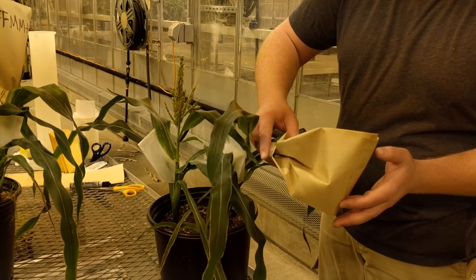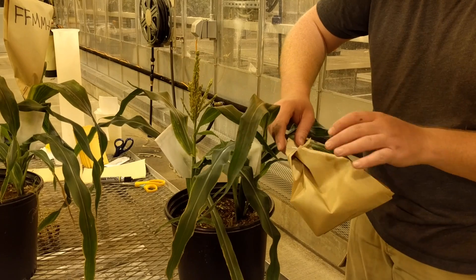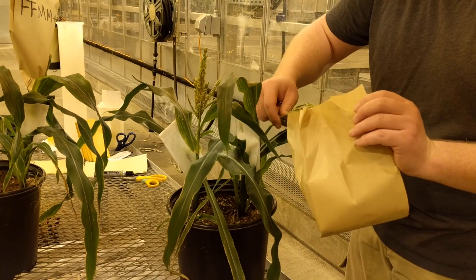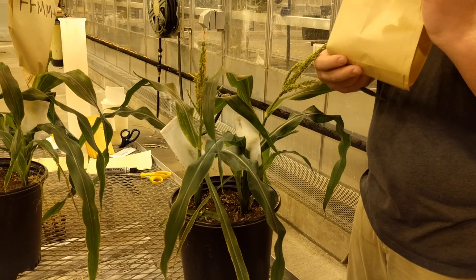Carefully bend the plant over so that any pollen will run into the tassel bag instead of out the opening. Remove the paper clip and open the bag, then shake the tassel to release fresh pollen. Separate the anthers from the pollen by opening the bag wide and holding it with a slight slope toward the opening of the bag. Gently tap the side of the bag to cause the anthers and pollen to roll toward the opening. Anthers will roll faster than the pollen and can be discarded. Pinch the bottom edge of the bag to form a trough that will catch the pollen and allow for more precise pouring. Set the bag aside where stray pollen will not fall or blow in.